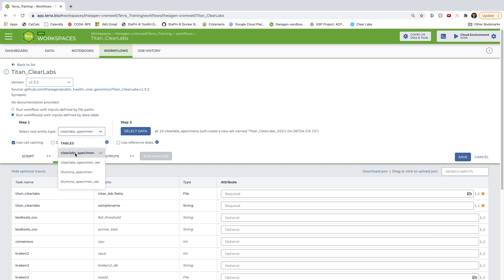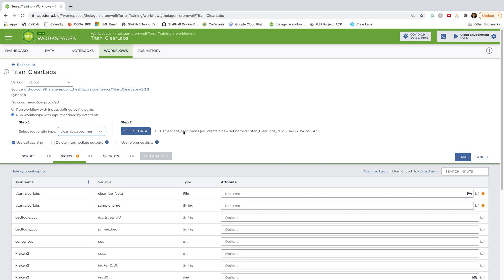And then let's select the root entity type or which Terra data table my input samples will be coming from. And in our case, it is the Clear Labs specimen data table. So I'm going to go ahead and click that. And you can see by default that it selected all 10 samples to be analyzed for this workflow. But that isn't what we want. Instead, we want to make sure that we only select samples associated with run 1.